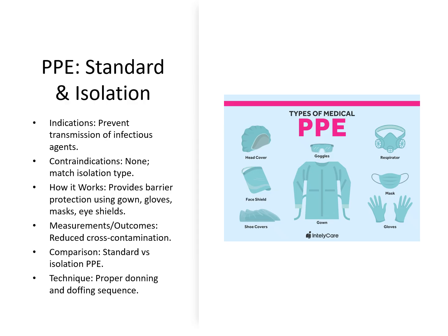Standard PPE differs from isolation PPE in that isolation PPE is specific to the type of pathogen. Proper technique includes correct donning and doffing sequence and good hand hygiene.